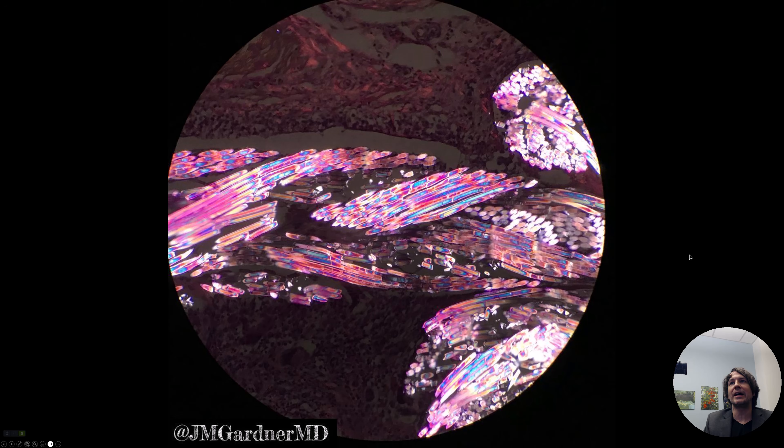And if that doesn't make you say ooh and ah, I don't know how to make you happy. So usually when I see some suture and I've got a medical student or a junior resident with me, I put in the polarizer and rotate the filter and it makes this beautiful rainbow. As I'm not showing it here because these are still pictures, but if you rotate, you can kind of see the rainbow shift. It's very pretty.